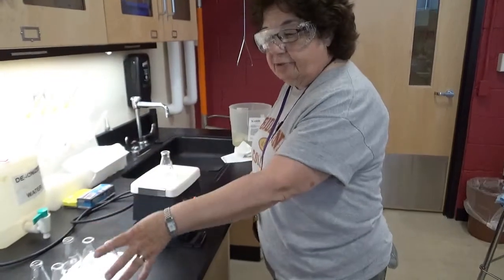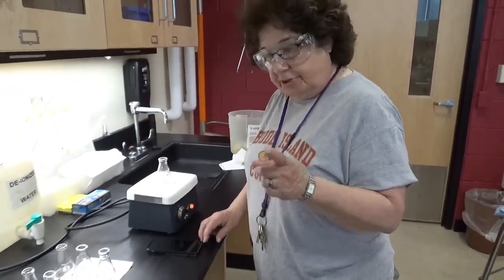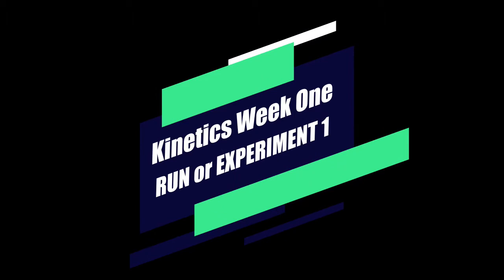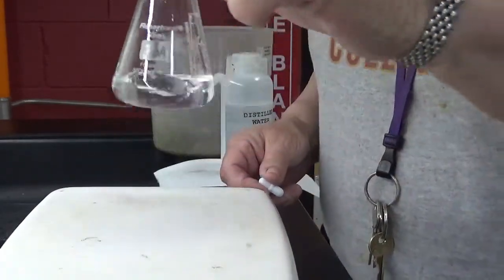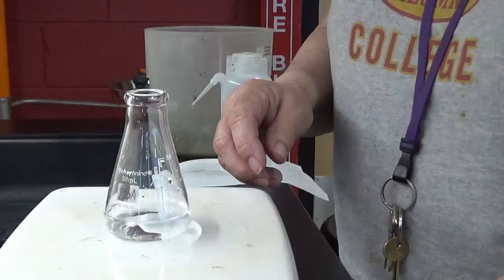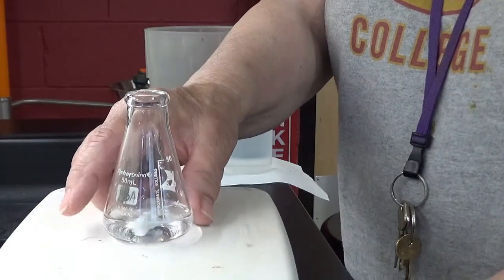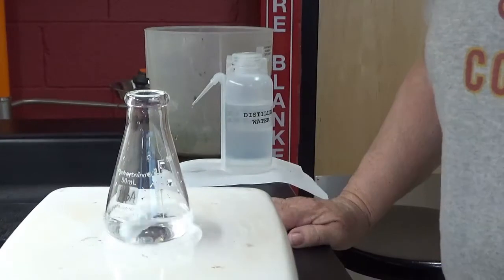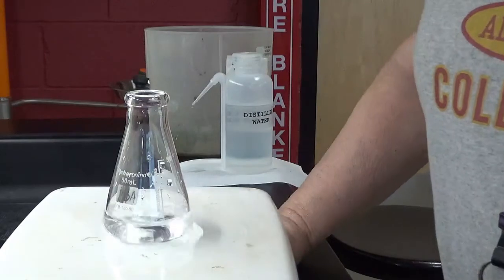And then as we do number 2, number 3, number 4, I want you to keep your own data sheet and your own times and write them down. And we're going to share those. So with experiment number 1, this is solution A, I'm going to put a stir bar in it and stir it up a little bit, not too fast. I hope you have your data sheet ready. We're going to do 3 trials, and we're going to be timing those 3 trials.